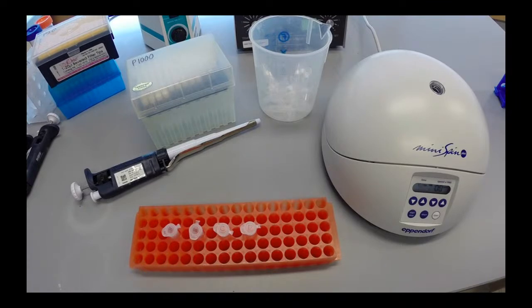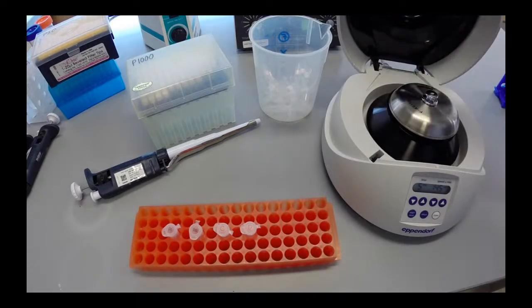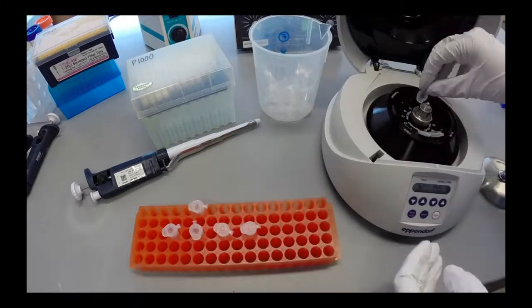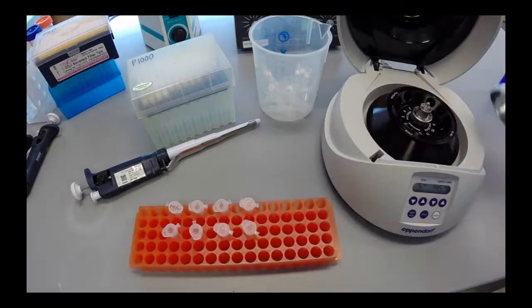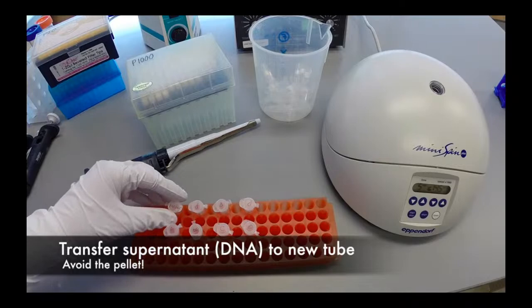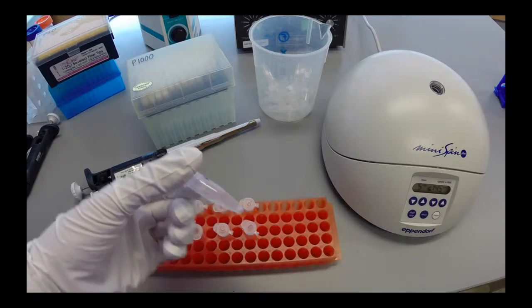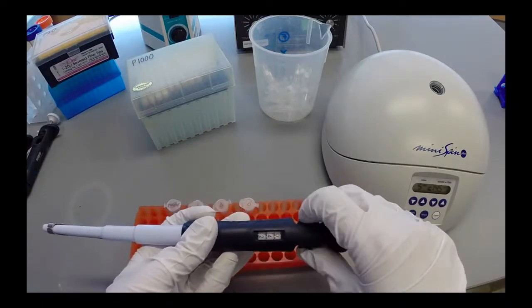When the spin is complete, the lid to the centrifuge will pop open. Remove the internal lid and remove the samples gently to avoid disturbing the pellet. Place tubes of the same sample in line with each other to ease the transfer of the solution. After centrifugation, you should be able to see a white pellet that has collected on the bottom part of the tube on the side of the hinge. This pellet contains the impurities in the solution. The DNA is in the supernatant.